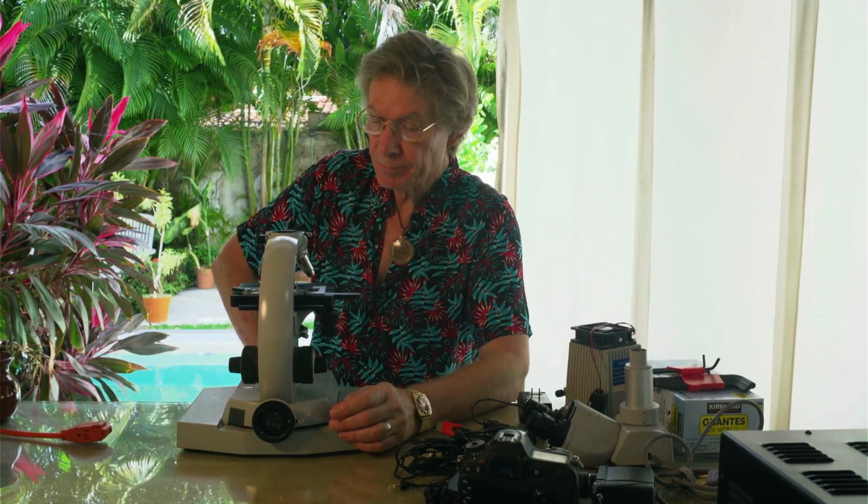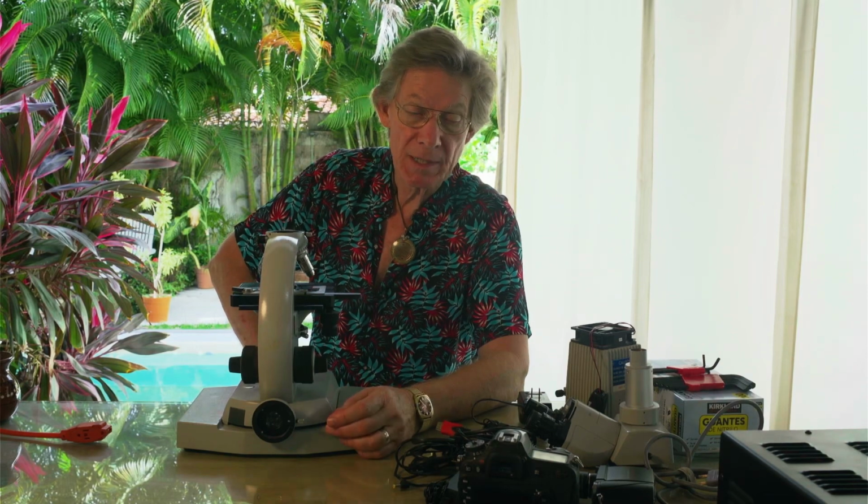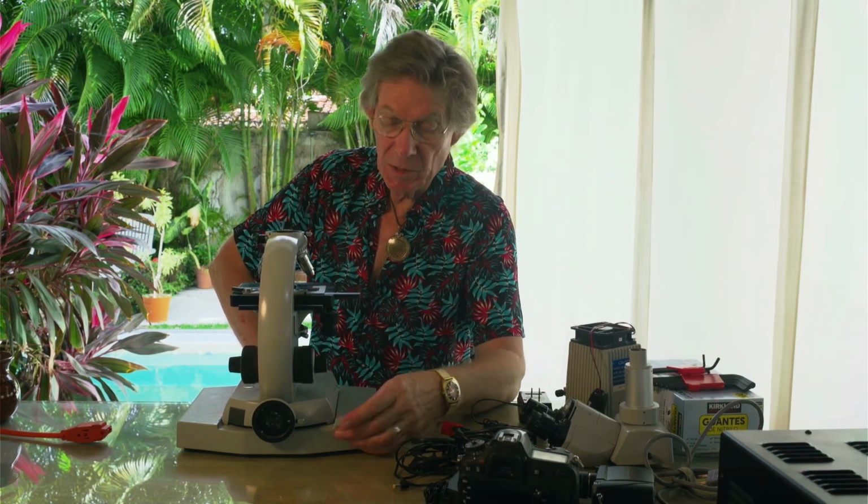So, today we're going to actually put together a microscope. I've been doing this for a very long period of time. Started in 1995 and took a fantastic course that was presented in Toronto, Ontario, Canada. And I was immediately enthused about the process and the art and science of live blood analysis and wanted to incorporate it into my naturopathic practice.